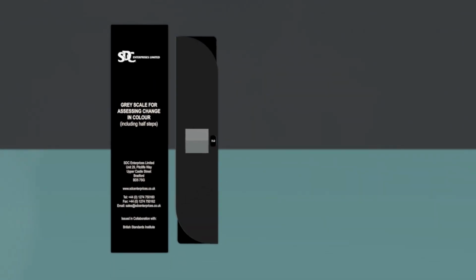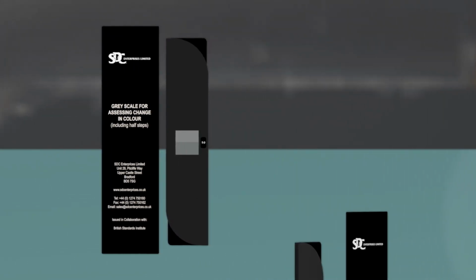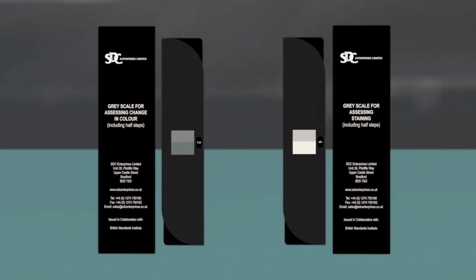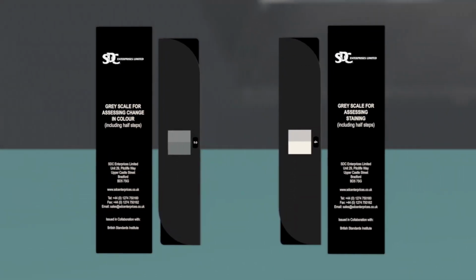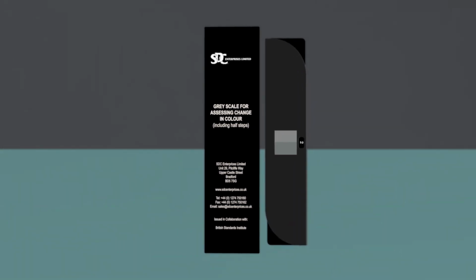The inside of the cabinet is coated in a paint which offers a specific shade of matte. The viewing table is set at a certain angle, which is designed to standardize and limit light reflectance. There are two types of grayscale: A02 for the assessment of change in color fastness of the specified sample, and A03 to assess the staining of adjacent materials. First, we will focus on A02, change in color.